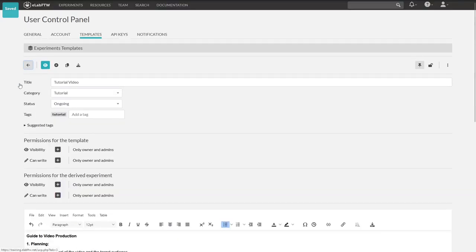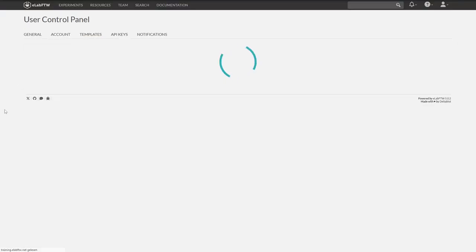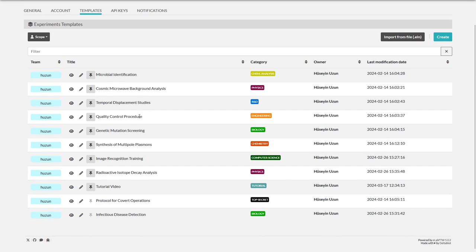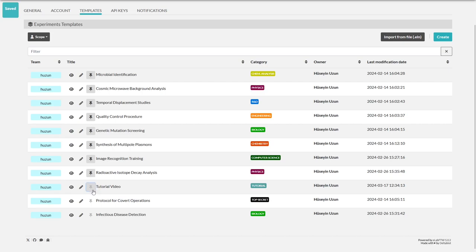Finally, I'd like to point out that when creating a lab notebook entry, only the templates that are pinned will be visible. You can easily pin the templates here or deactivate them.